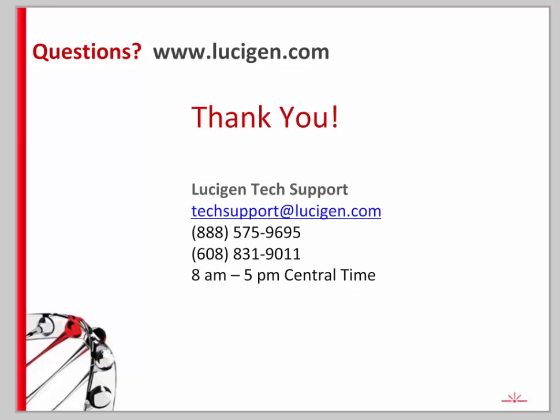Okay, great. And then our next question is about Lucigen having a specific competent cell type that's best for both cloning and expression. So one-step transformation for cloning and expression. Do you have any recommendations, Eric? So actually we have a cloning expression system that uses a bacterial promoter and uses the 10G cells as the host. And that's usually a very effective expression system.